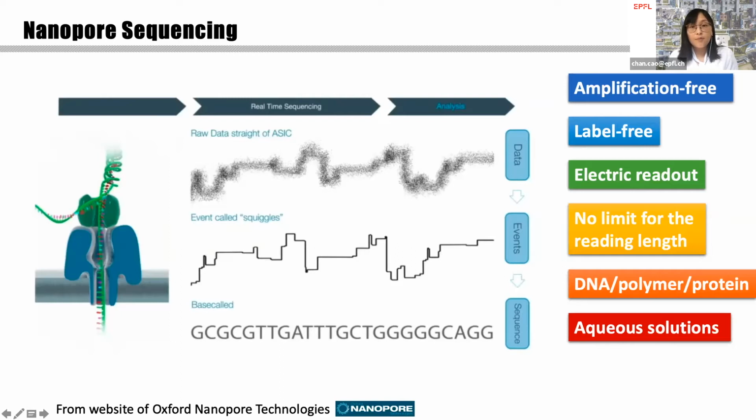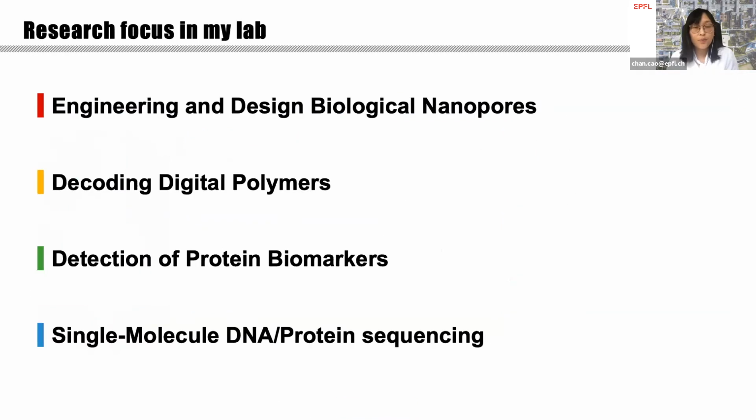And the last and most important point is that this approach is conducted in solution. So although it's high salt concentration, compared to other methods, it's closer to the native environment of the biomoleculars.